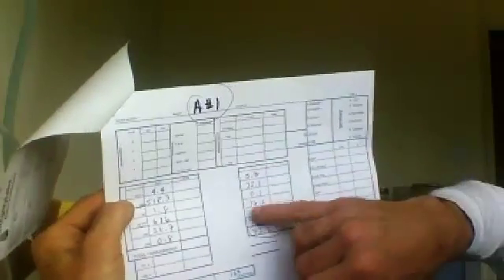THCV, very small amounts. Then we come to Delta 9 THC, tetrahydrocannabinol, which was 38.2. So you see they're very much nearly close to 50-50. It's pretty cool. And then we come down to the CBG at 1.4. Not too bad.